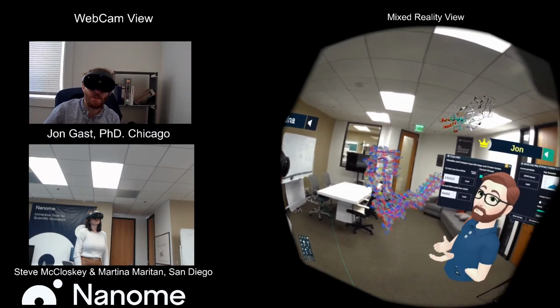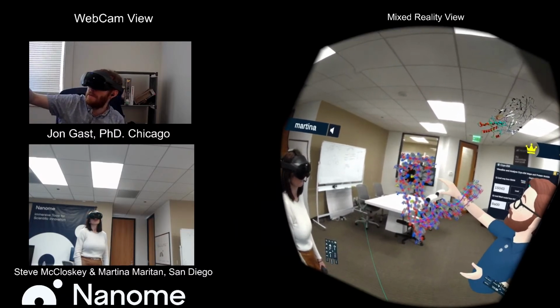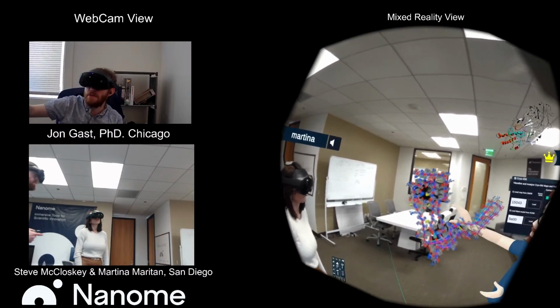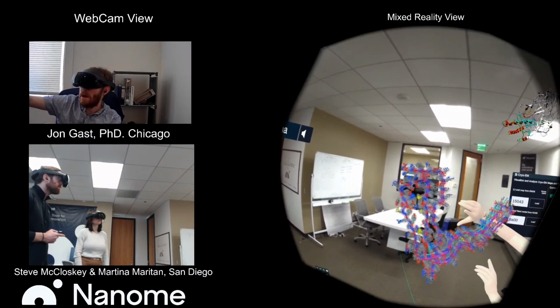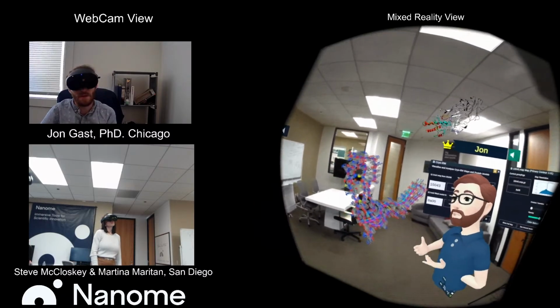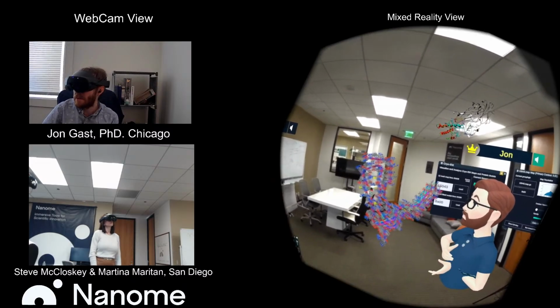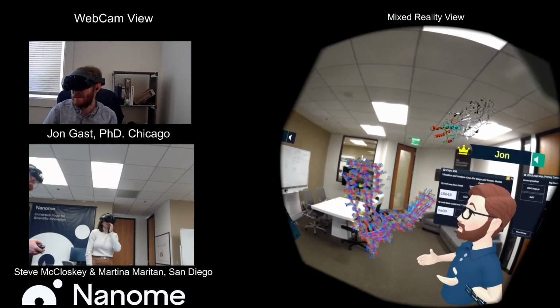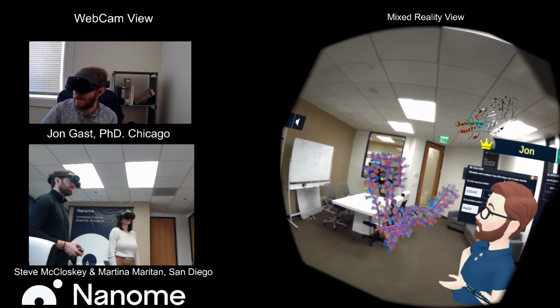Right now, we brought in a solved one, but oftentimes, when you haven't quite finished it yet, you might have more than one that you're considering, and being able to see multiple different models fit within the map to understand: did I order this the right way? Do I maybe think something slightly different? These are all things that can also occur. We did look at sort of a finished product today, so those aren't quite as obvious.